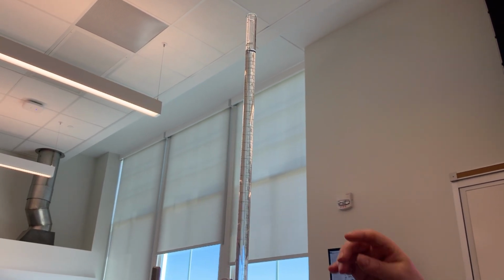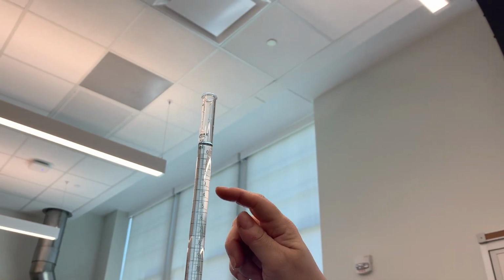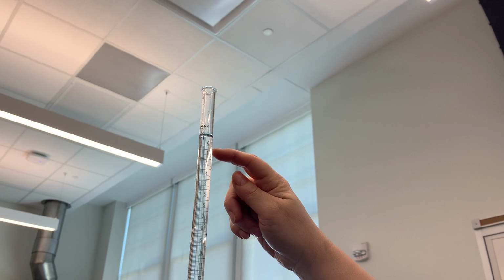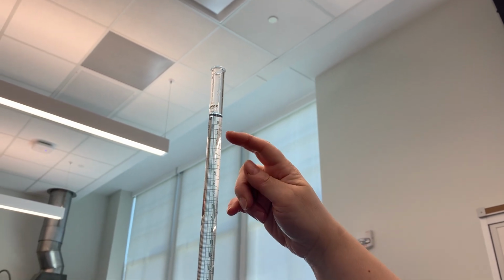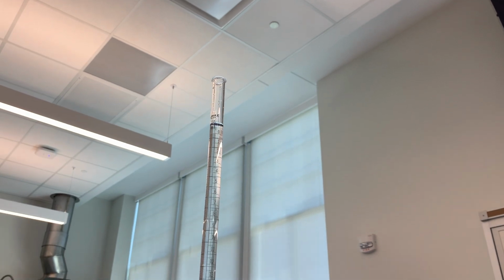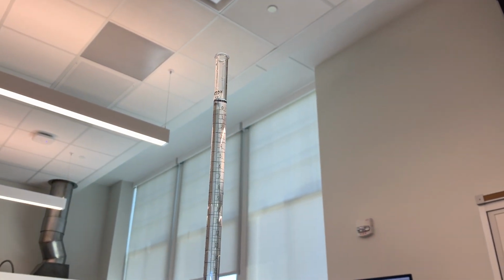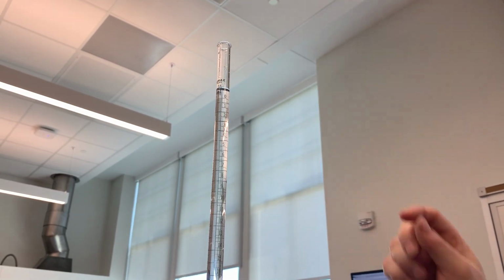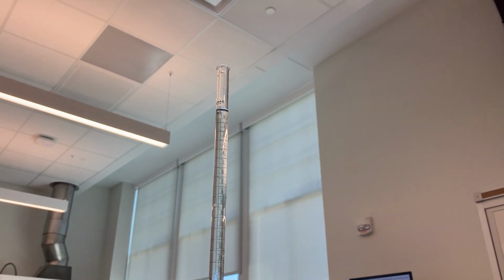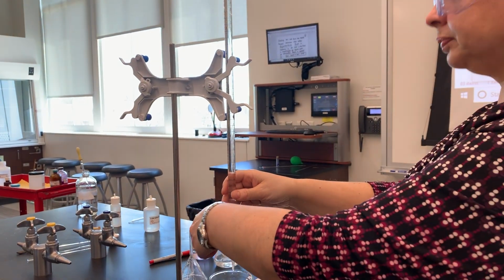I'd like to have my initial reading somewhere between 0 and 1. It is not necessary to have it right at 0, because you can always take the initial reading, record it, and later subtract it from your final. When you're reading the burette, it's important to make sure your eyes are aligned with the level you're reading. So I'm going to drain a little bit of liquid, then lower the burette, and take my reading.